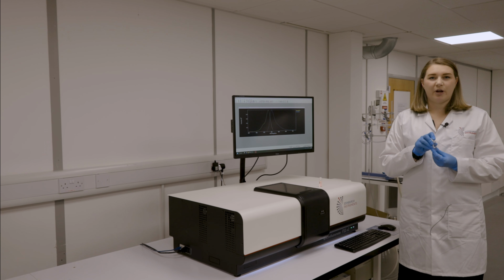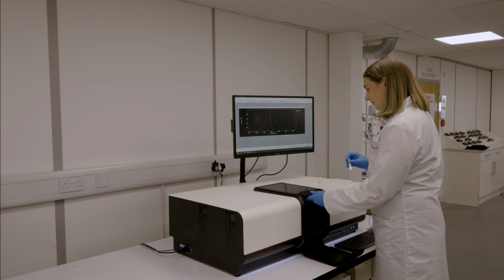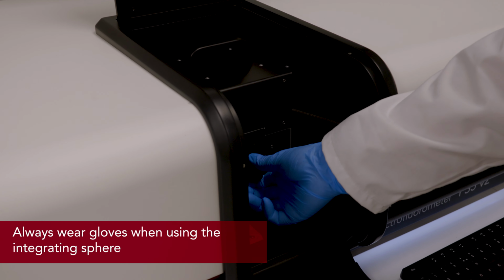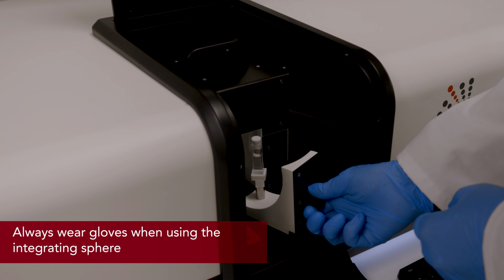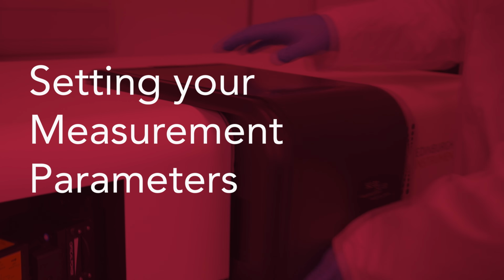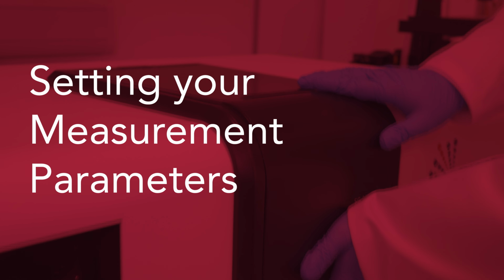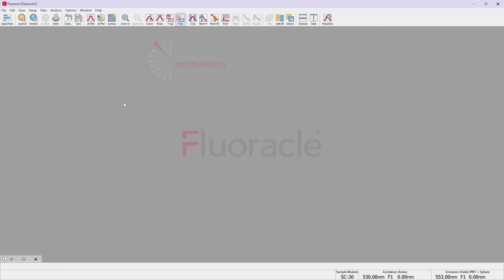To determine the measurement parameters, first we put the blank into the SC-30. For quantum yield measurements, we measure the scattered excitation photons. Since the blank doesn't absorb the excitation light, the scatter peak will have a higher intensity compared to the sample. So we use the blank to set our measurement parameters.